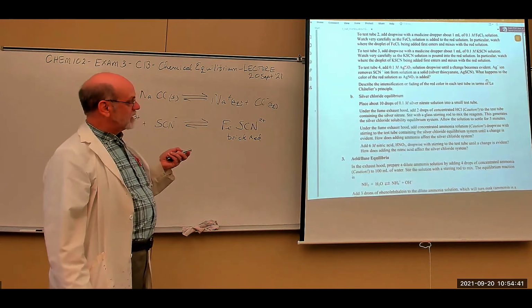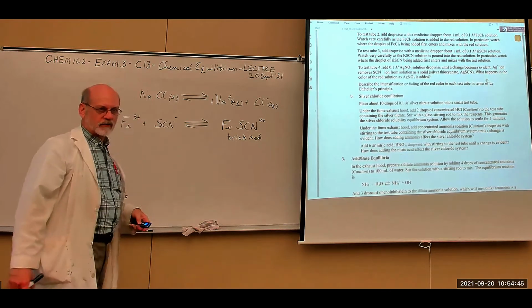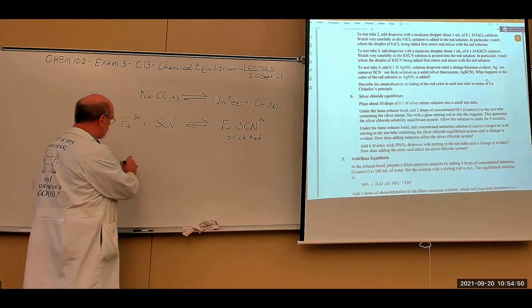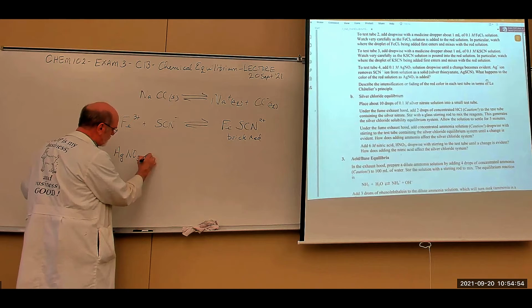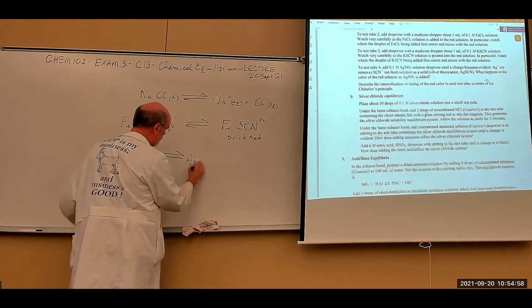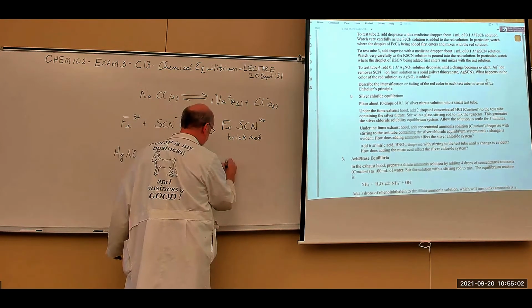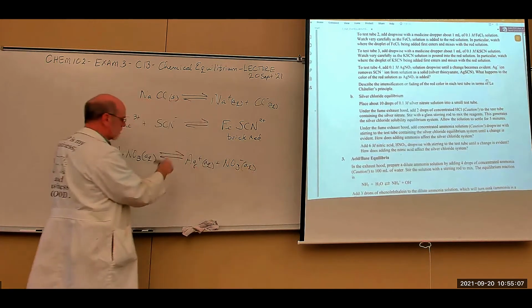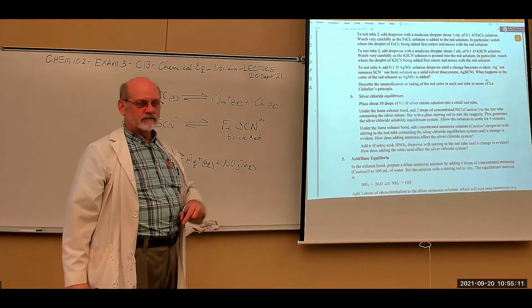Well, add silver nitrate. These are what are called coupled reactions, because the silver nitrate in aqueous solution completely dissociates into silver ions and nitrate ions. Nitrate's not going to react with any of these. Why? Because all nitrates are soluble.